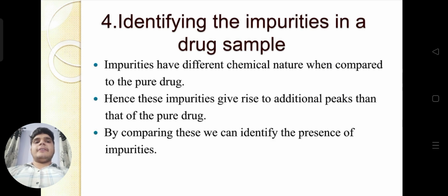The fourth application is to identify the impurities in a drug sample. The impurities have a different chemical nature when compared to the pure drug. Hence, these impurities give rise to additional peaks compared to that of the pure drug. By comparing these, we can identify the presence of impurities by IR.